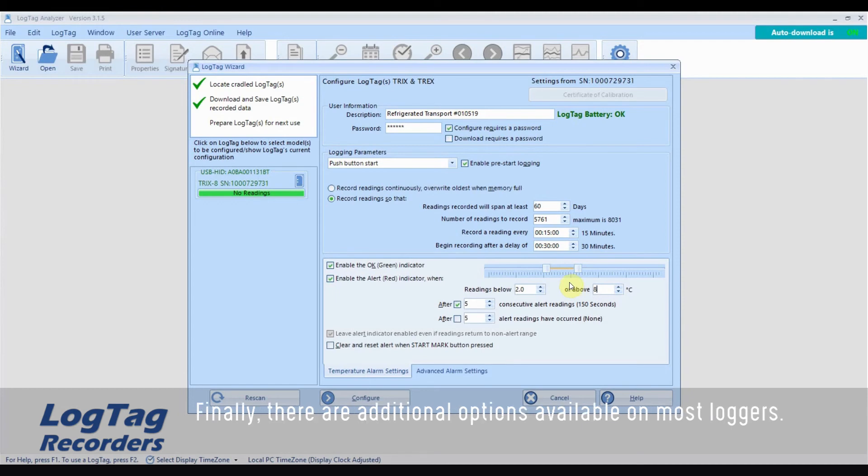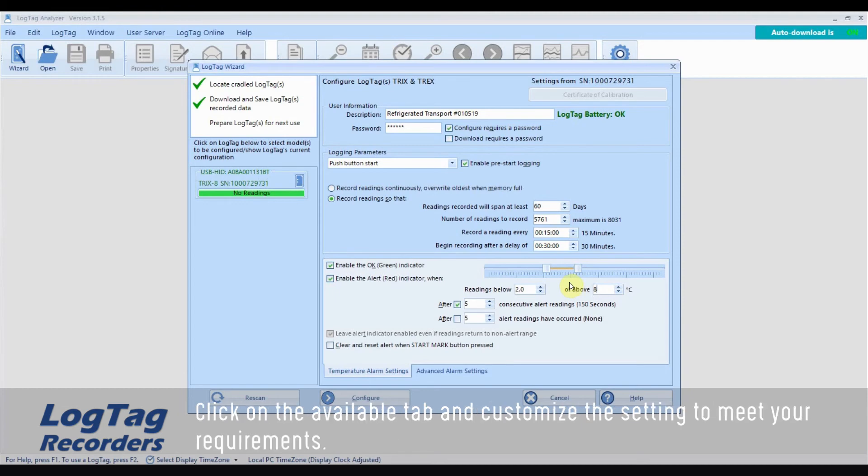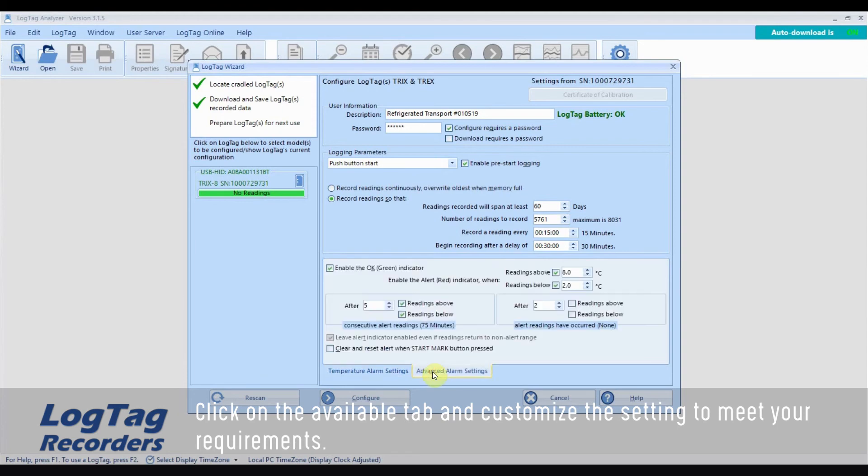Finally, there are additional options available on most loggers. Click on the Available tab and customize the settings to meet your requirements.